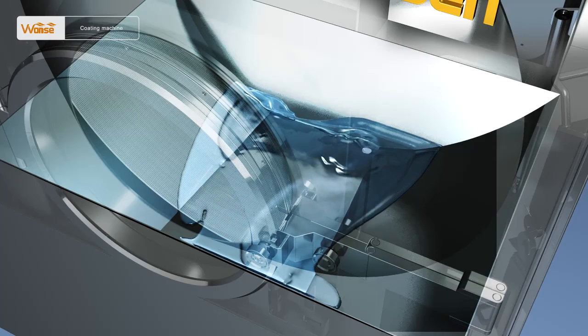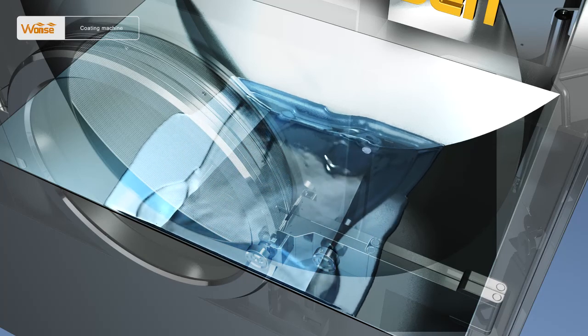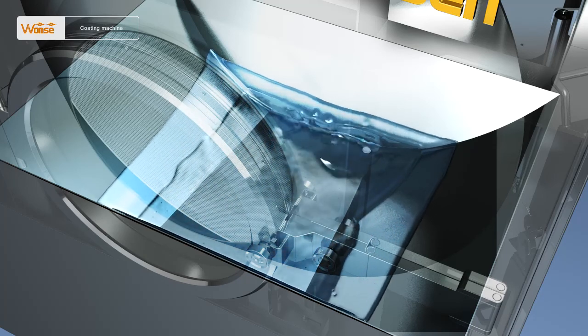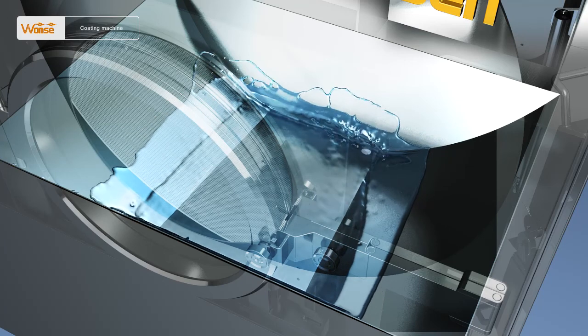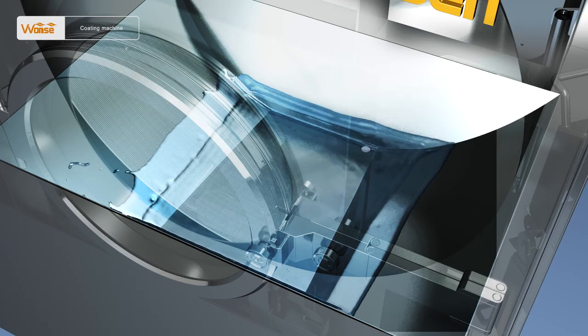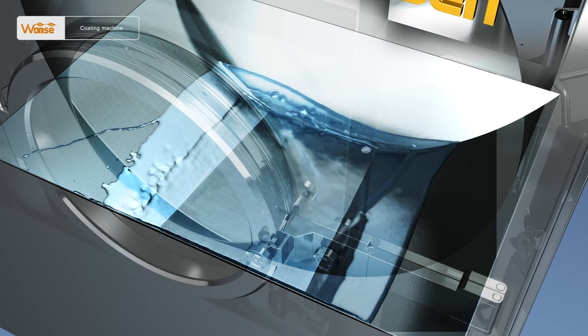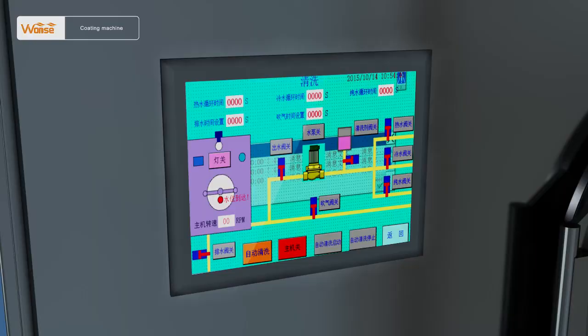Second, open the drain valve of the washing liquid cleaning tank to supply water again. Start the cleaning water valve of high pressure pump and the corresponding water output valve until the cleaning tank water level reaches the high water level. Close the cleaning water supply valve and high pressure pump. Open the detergent metering pump and output valve. Start to supply the detergent until the set volume is reached and then close the pump and output valve.